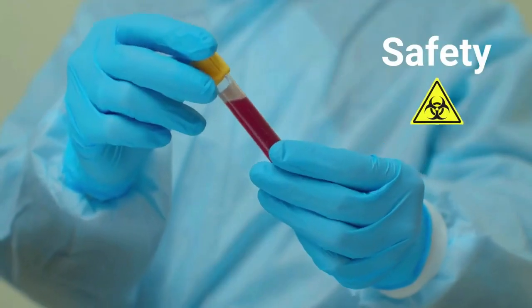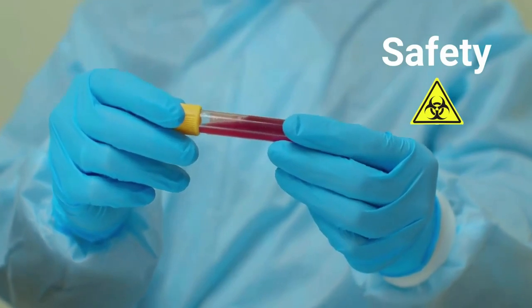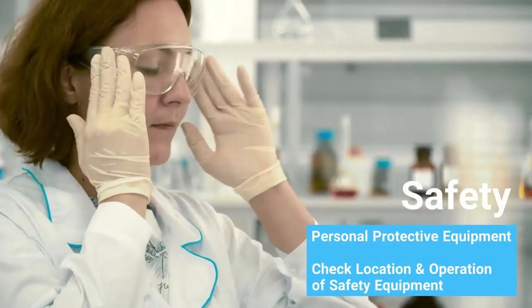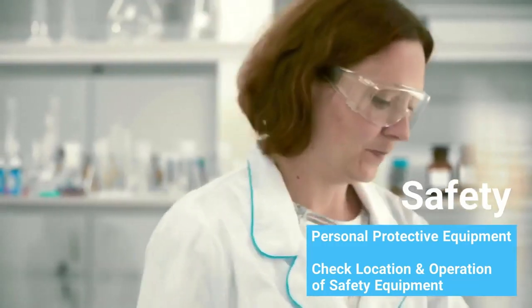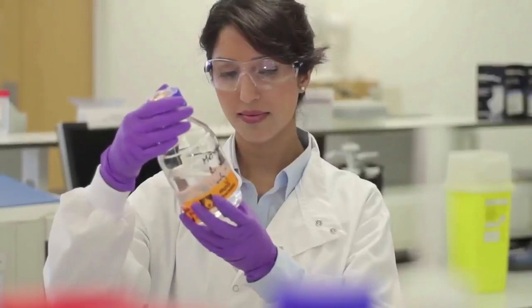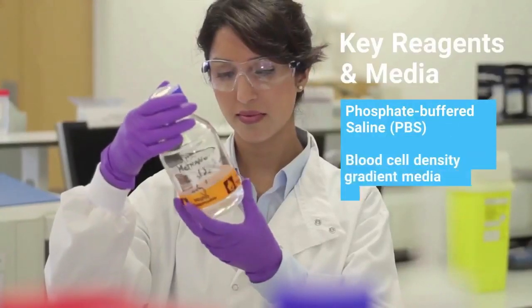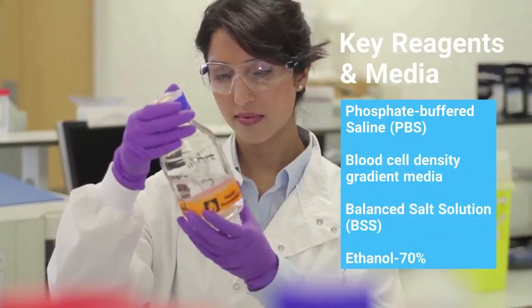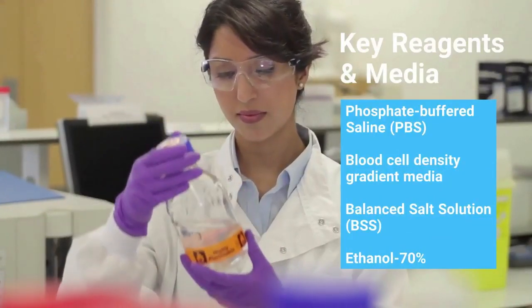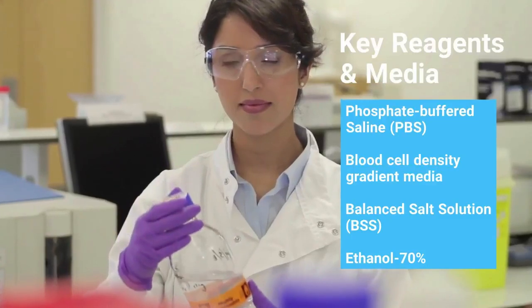Before initiating any laboratory procedure, it's important to complete several preparatory steps. First, treat all human biospecimens as potentially infectious and ensure you are taking all necessary safety precautions, including personal protective equipment and checking the location and operation of laboratory safety equipment. Second, make sure you have all equipment, materials, and reagents needed to complete the isolation protocol. Treat all surfaces and non-sterilized materials with an effective antimicrobial solution, such as 70% ethanol.